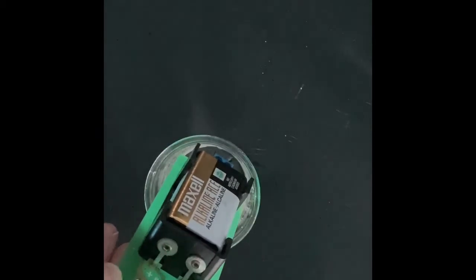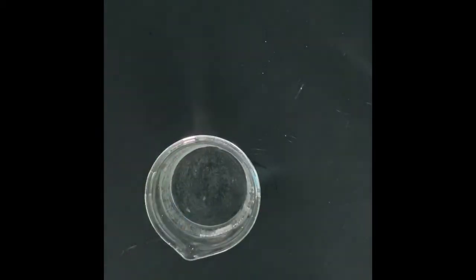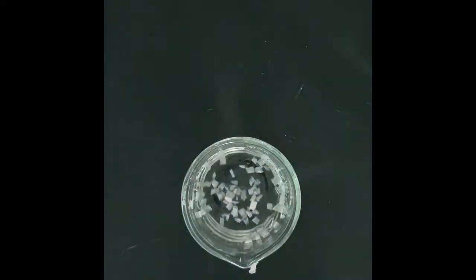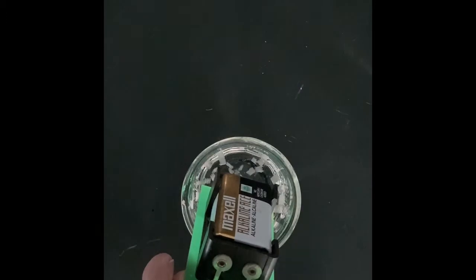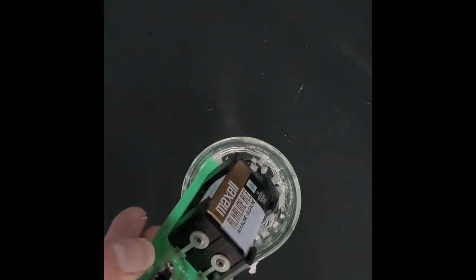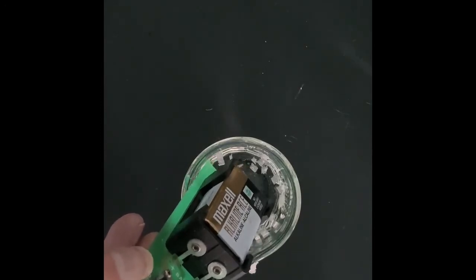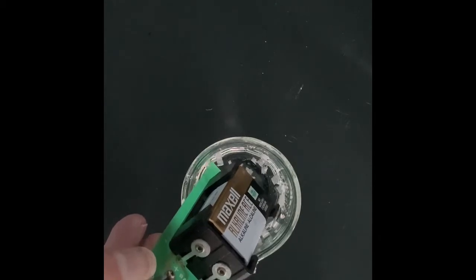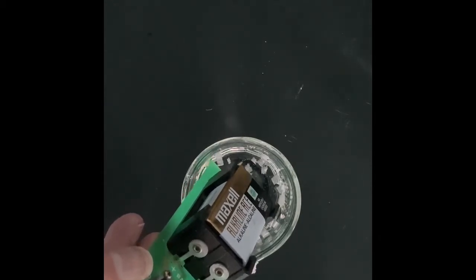Yeah, so this one, because I know it's hard to tell you guys if it's bright or not, that would be considered like a medium red. Here's our paraffin wax. So just a titch of red. Yes, not very much red at all, and not really green. Just a slight, if anything. Yep, so I would say, there we go.